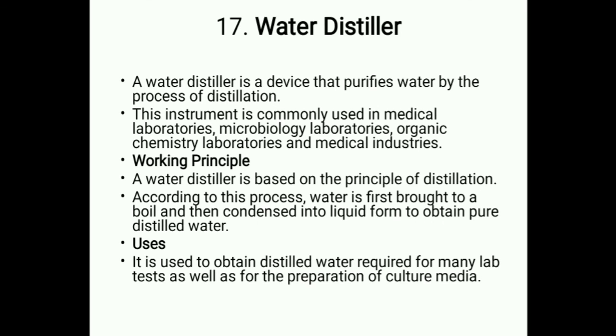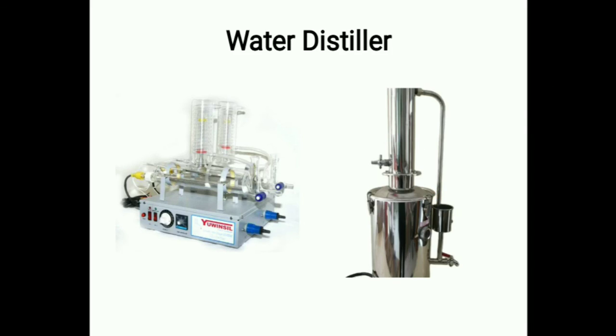pure distilled water. Talking about the uses, it is used to obtain distilled water required for many lab tests as well as for the preparation of culture media. So this is the distillation unit.